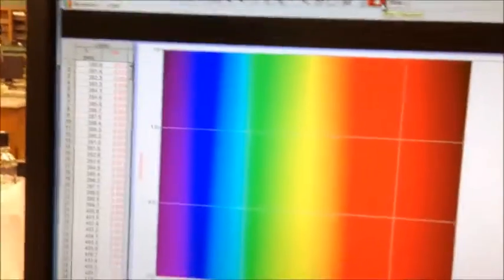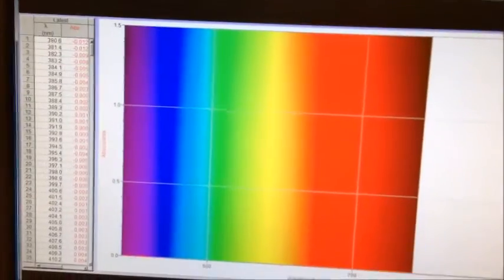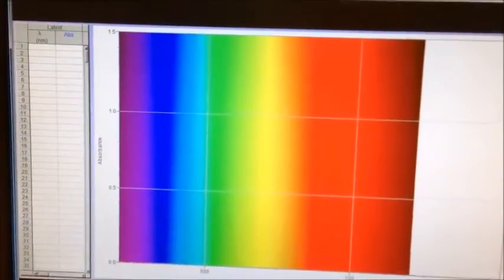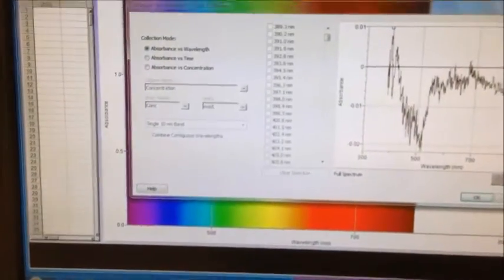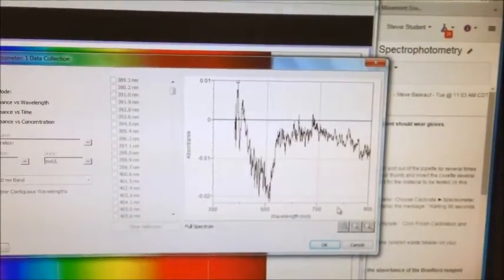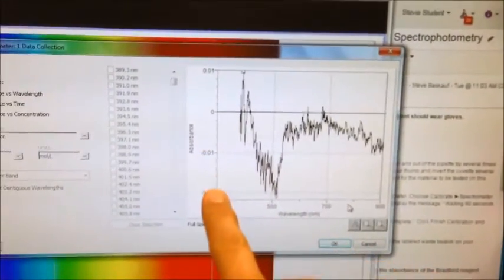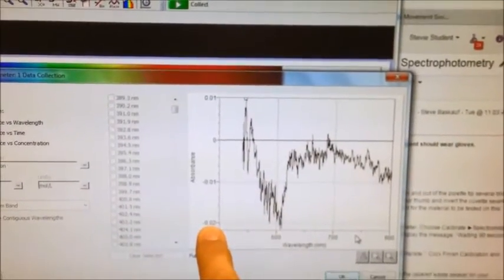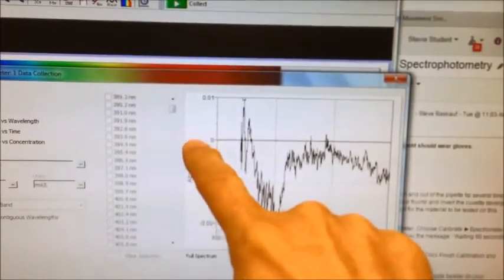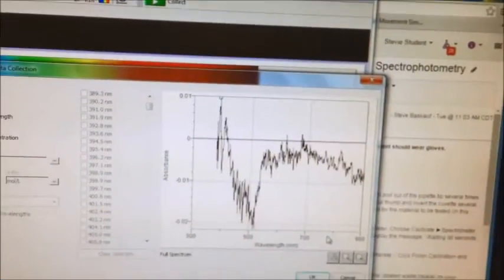Tell it to stop, store latest run, show me the calibration curve. Now if you look at this curve, it's kind of hard to understand what's going on. But what you should notice is the scale. The maximum value in the scale is .02. This is essentially zero. Basically, I'm getting nothing all the way across in the graph.